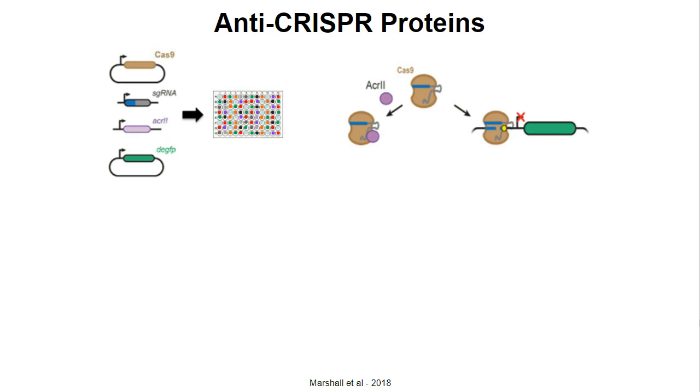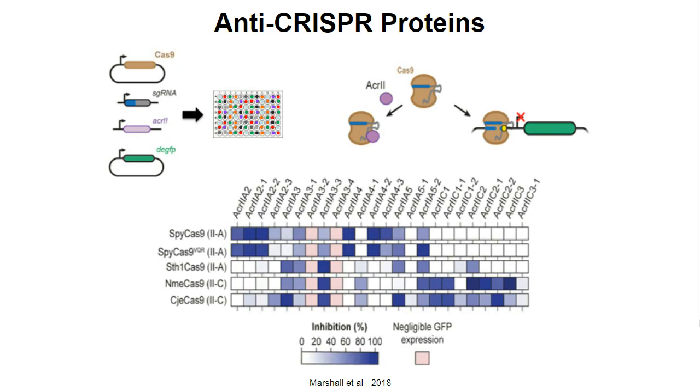And so we have our reaction, we put all of this into the source plate with the TXTL components, and we get our measurements. In the same paper done by Ryan, Noireaux, and everyone else, you can see there's 24 different anti-CRISPR proteins, and there's 5 different Cas9 enzymes. For each Cas9 enzyme, we checked which of the anti-CRISPR proteins would work. That's 24 times 5, and for each of them, you have to do replicates. So that's 120 different reactions.